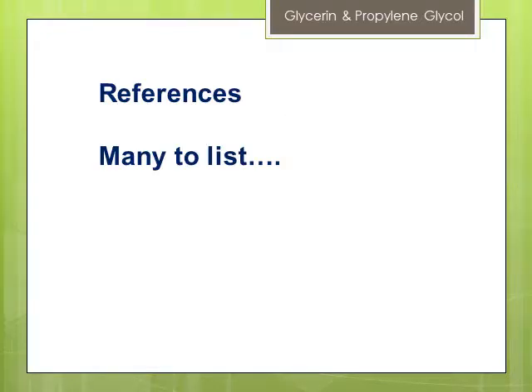For references, there are too many to list, and if you look online you will see tons of methods out there that talk about the separation or quantitation of glycerin and propylene glycol.